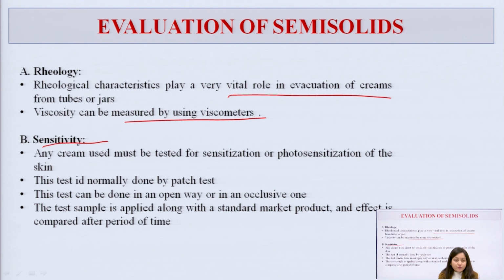This test can be done normally by undergoing a simple patch test. Simply, a certain part of the skin is taken, and that particular cream is applied on that area. We apply the cream initially and leave that area for a certain amount of time. After that period, we analyze the area, whether it was affected, whether it was inflamed, or whether it became sensitive to heat, light, or moisture. So this helps us to analyze the sensitivity of our product.